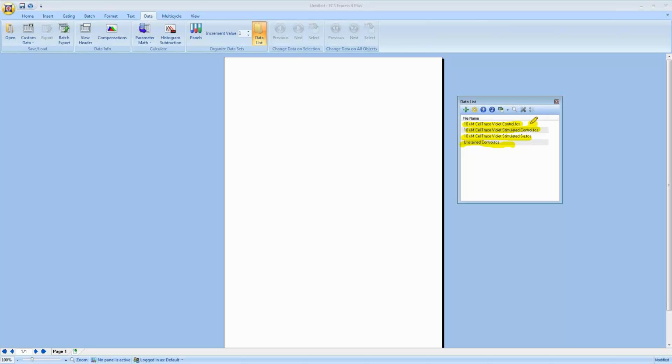Once we set this up, we're going to do a batch analysis of these multiple data files. We're going to put these out to PowerPoint. We're going to put statistics out to Excel. We're going to show you that we can save this analysis so that you can use it as a template in the future for other analysis. So let me erase these drawings, and we'll get started here.